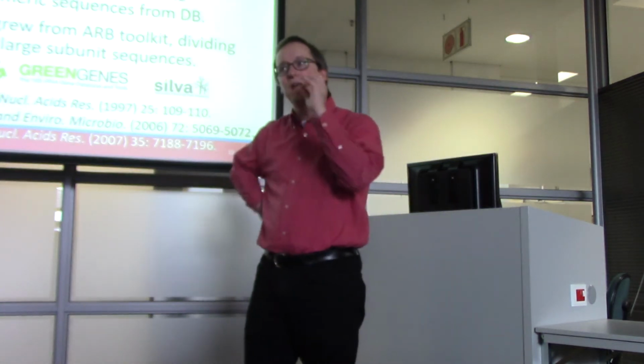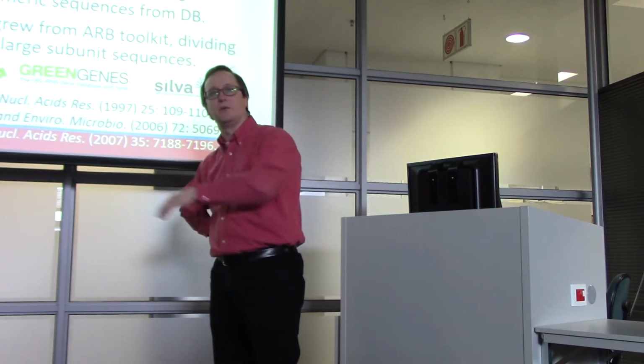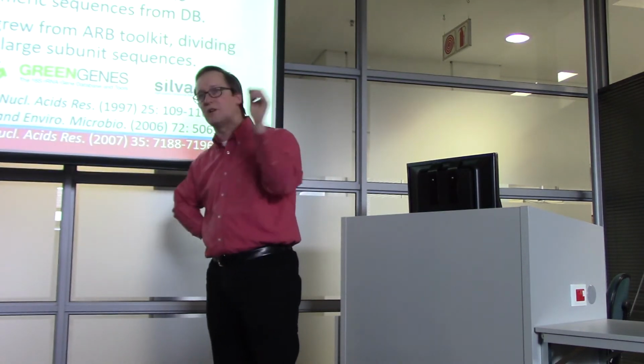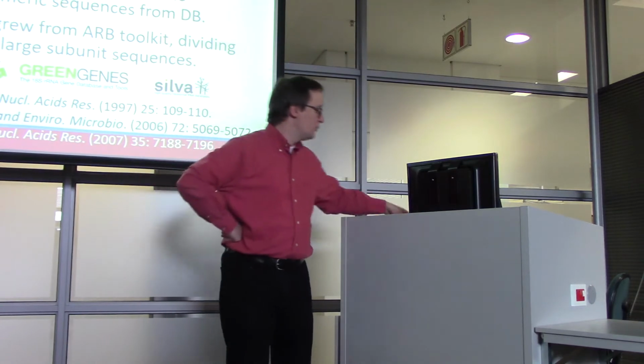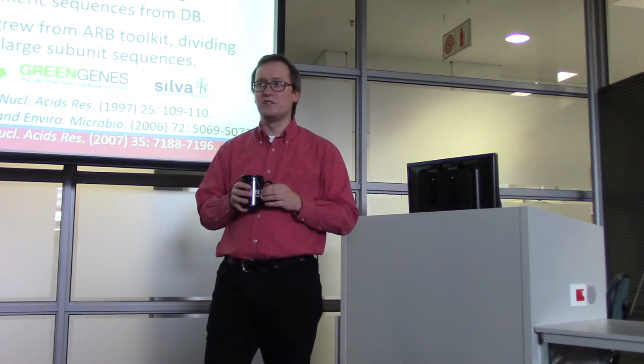Great. So if we have the ability to do this clustering and to do this noise suppression that we've talked about by getting rid of chimeras, getting rid of single reads, whatever you want to do, we still need to be able to say, what does this cluster of sequences represent?